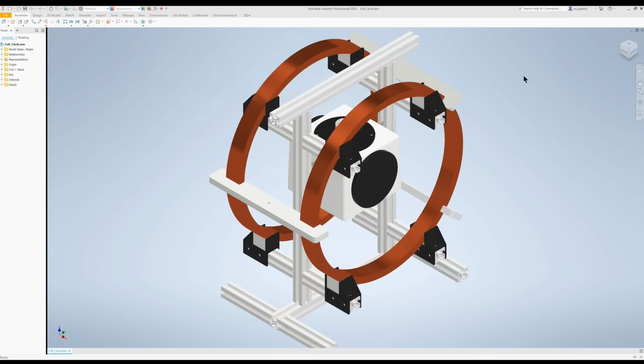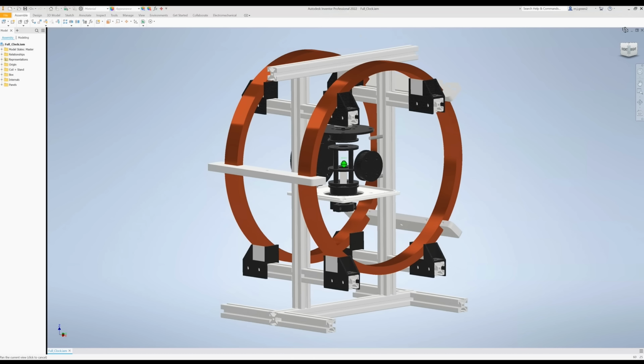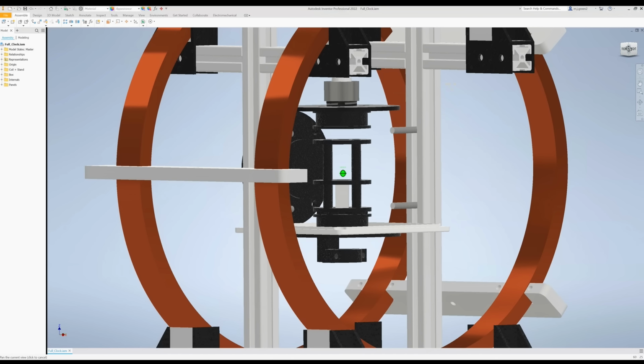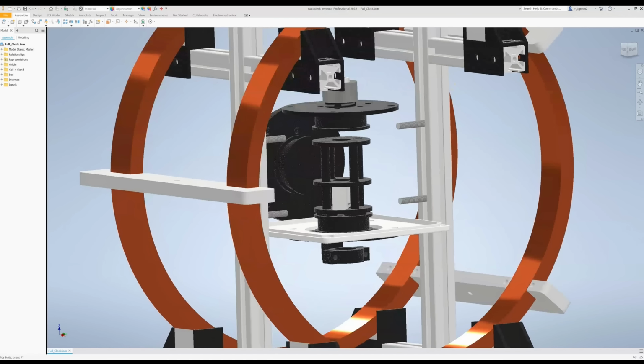You're now looking at a digital version of the spectrometer, which I designed in Autodesk Inventor. Autodesk Inventor is really useful for designing components in experiments because it allows you to look at all the parts and see if they fit together. And also you can even start to look inside of walls or take away parts you don't want to see, so you can really get to the nitty-gritty in the center of things and make sure everything will work together.